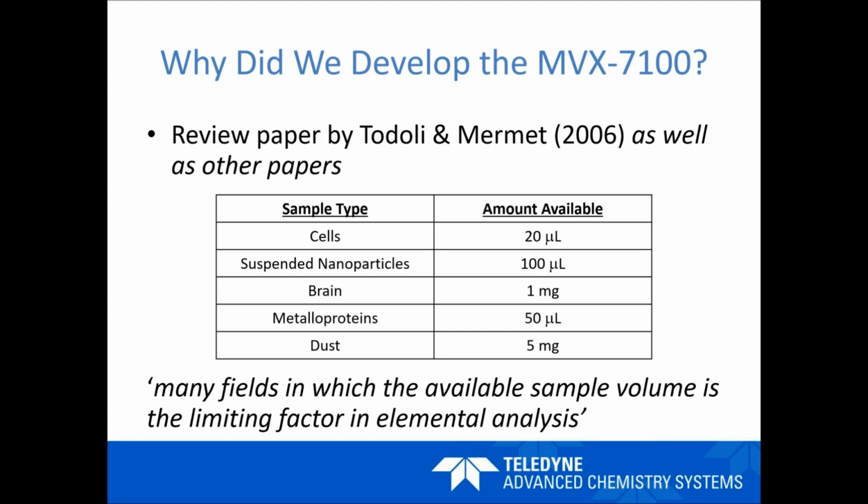There's the question of available sample volume or sample mass. In that case, there just might not be any more sample available to you. You might not be able to take any more. There are also limitations in certain fields that you might have to consider. An obvious one is blood analysis. If you take a blood sample from an adult, you're most likely not going to have any limitations at all when it comes to sample volume, because you can take, say, tens of milliliters from a person for analysis if you needed to, which you'd then dilute or digest, and you'd have plenty to work with.